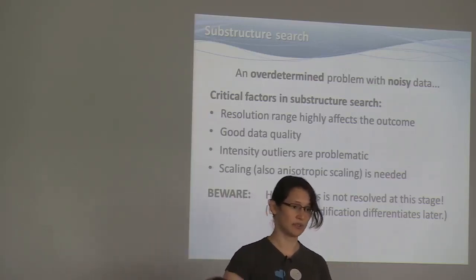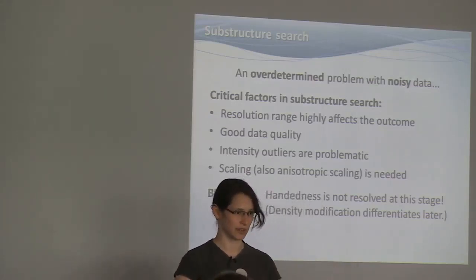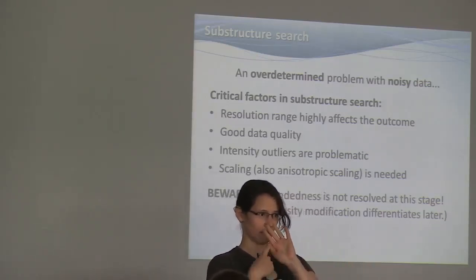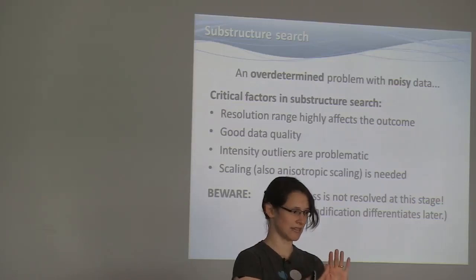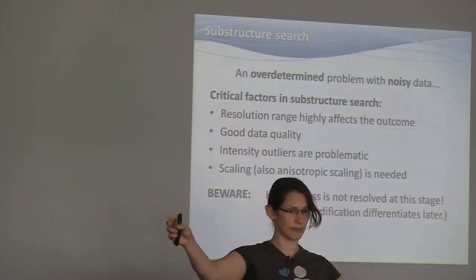One of the low-resolution reflections, which have major influence in direct methods because they're very strong and absolutely used for direct methods, was half obscured by the beam stop in one of the images. If that image was kicked out, the structure would solve. If it was left in and integrated, it gave rise to a huge anomalous difference.